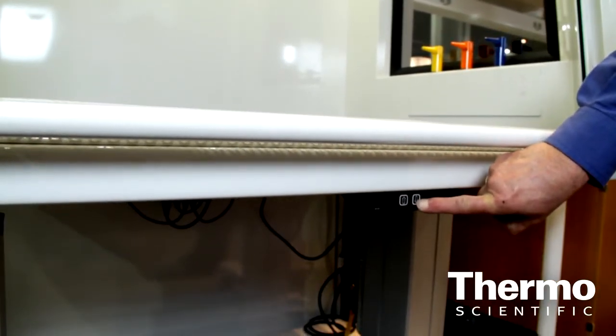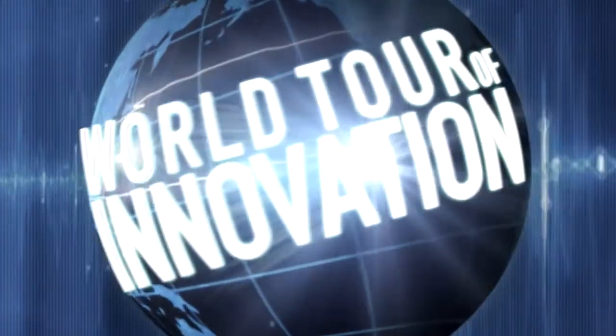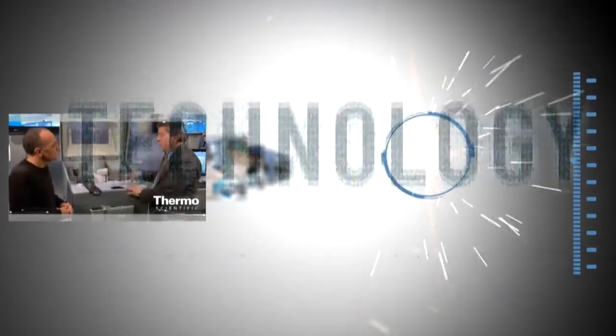This unit is height adjustable from 29 to 42 inches, so you're covering sit-down procedures, ADA applications, and stand-up procedures. Again, this is all about energy savings, green technology, Bluetooth technology, and ergonomics. Learn more at thermoscientific.com/Hamilton.